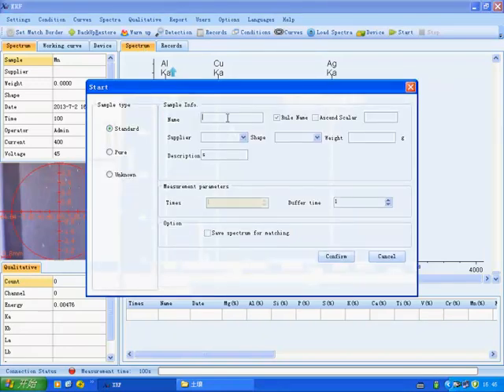Enter some information about the sample and click Confirm to start the measurement.